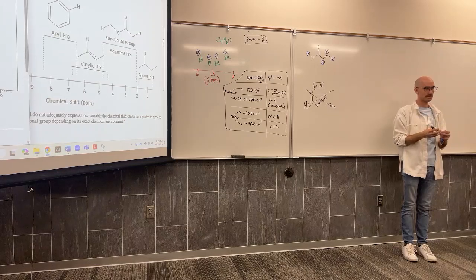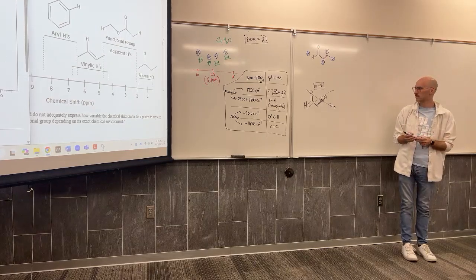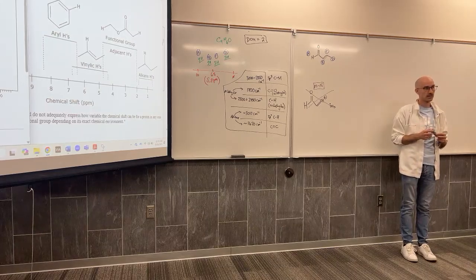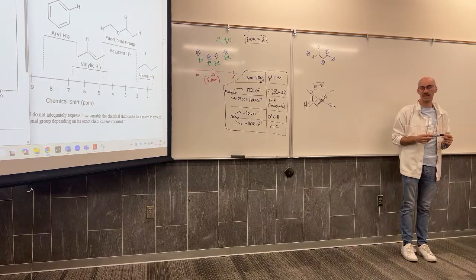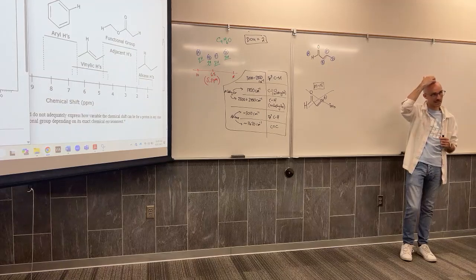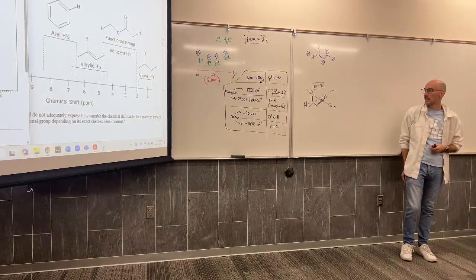Aiden? I was going to ask you, if this were plausible, like if the aldehyde didn't exist, would the resonance draw it out to go to the lone pair, or would you just draw it with the double bond still there? Because you mentioned that double bonds can still stay there, but I thought they would have to jump up to the lone pair. I don't think I'm catching what you're stepping in. So that CH is double bonded, right? And I remember you mentioned sometimes the double bonds can stay there even when the radical is elsewhere. But since that methyl has a double bond right there, wouldn't it just go up there and put a lone pair on top and the other double bonds go there?